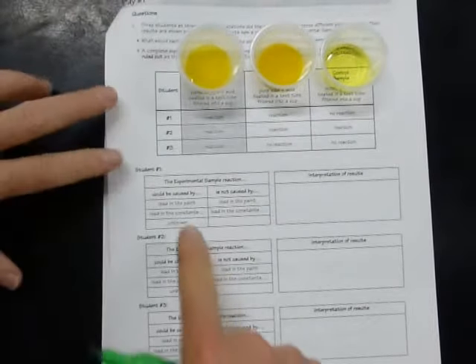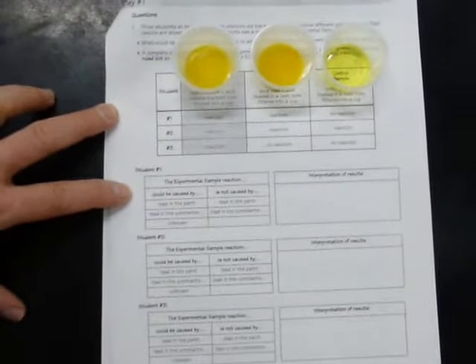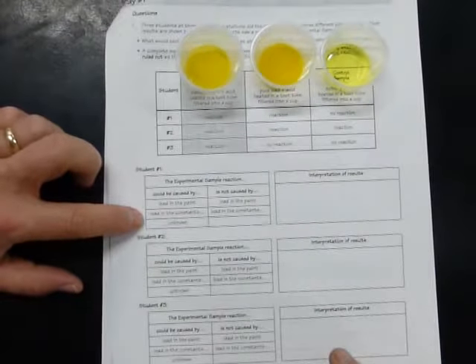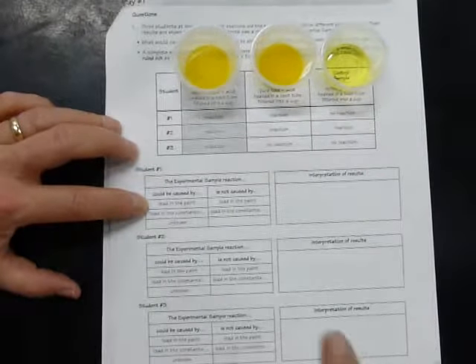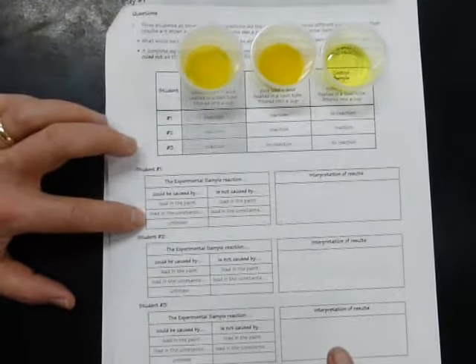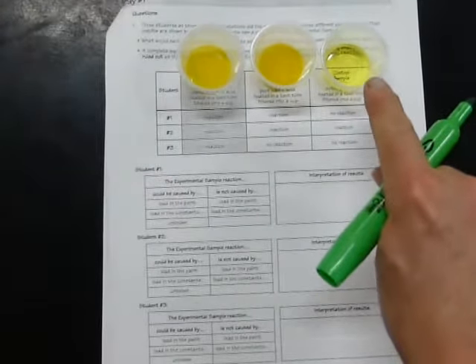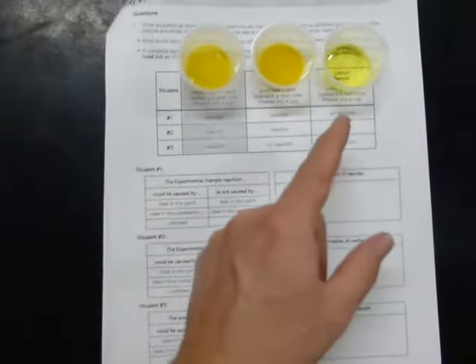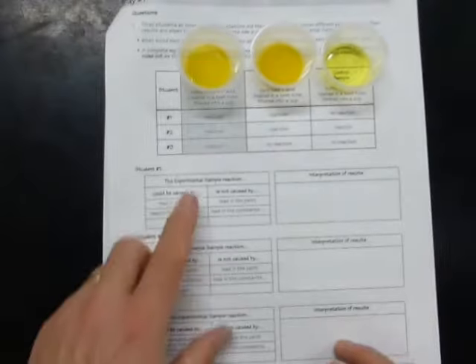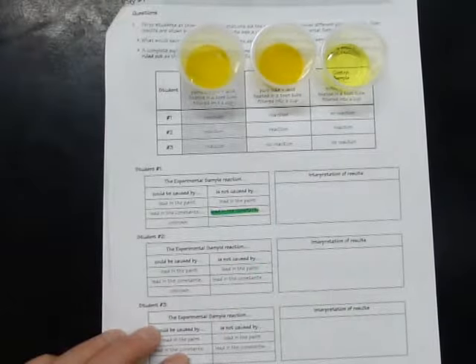So student number 1, what could have caused the yellow reaction here in the experimental sample? Is it that there's lead in the paint? Is it lead in the constants? Or is it unknown? So I know that it's not caused by lead in the constants, that the materials used to do the experiment didn't have lead contamination. That's what the control tells me. The control used the same filters and cups and test tubes and acid as the other samples did, and since there was no reaction here, I can be sure that the experimental sample reaction is not caused by lead in the constants. So I know that for sure.